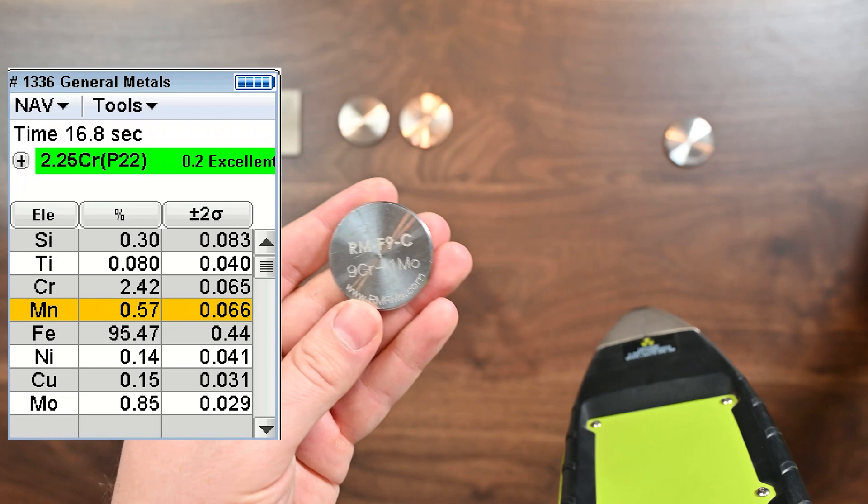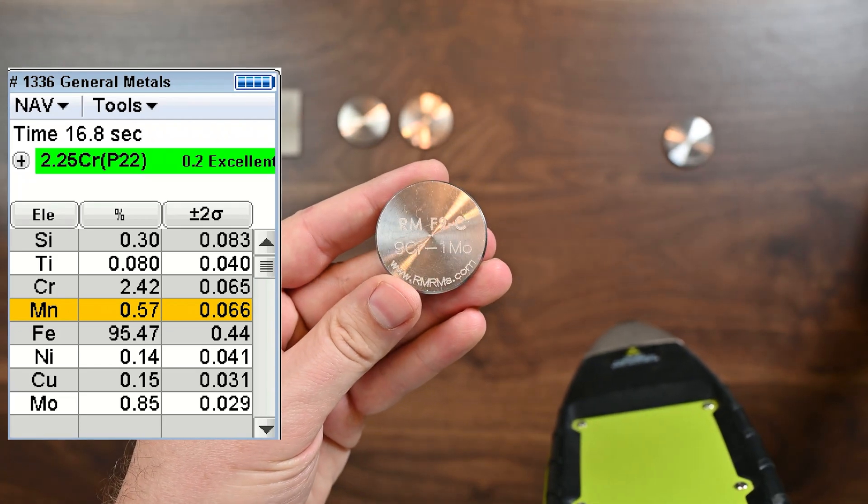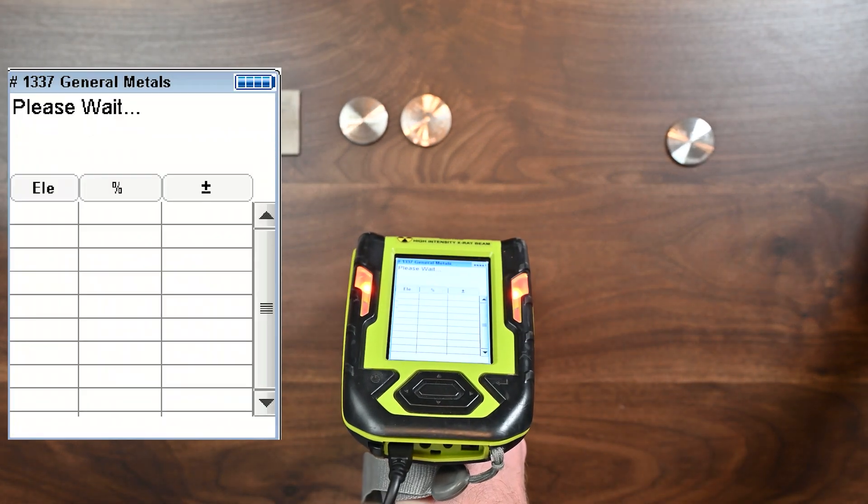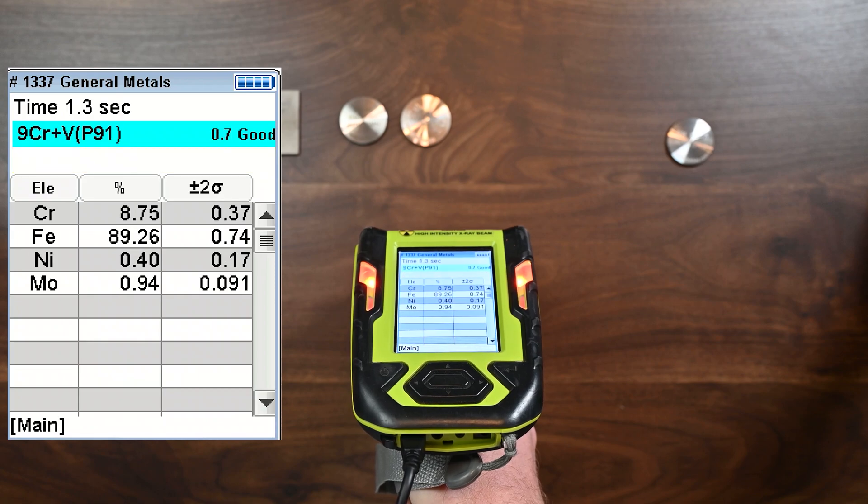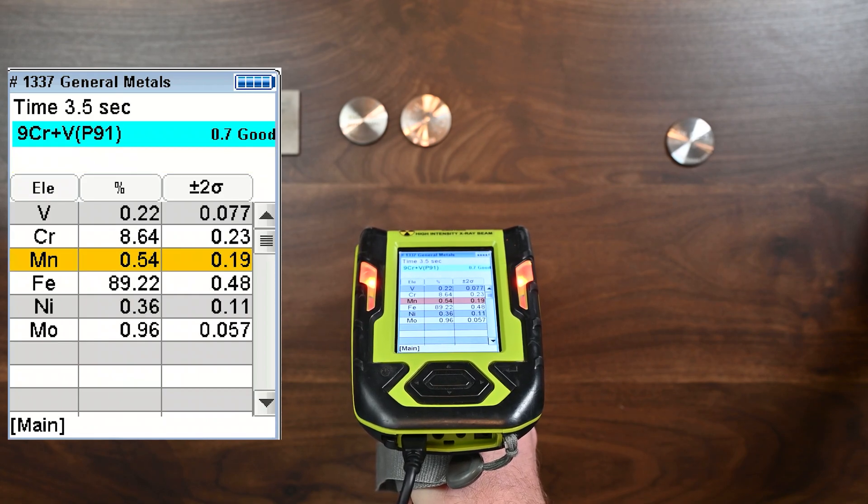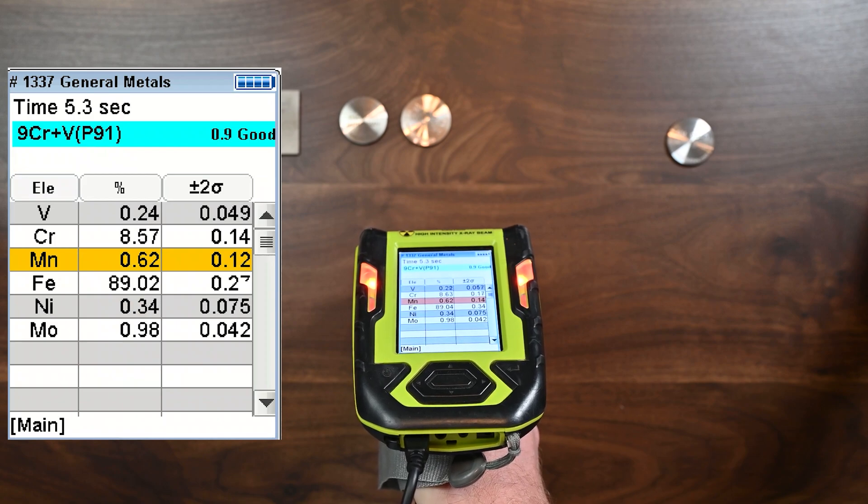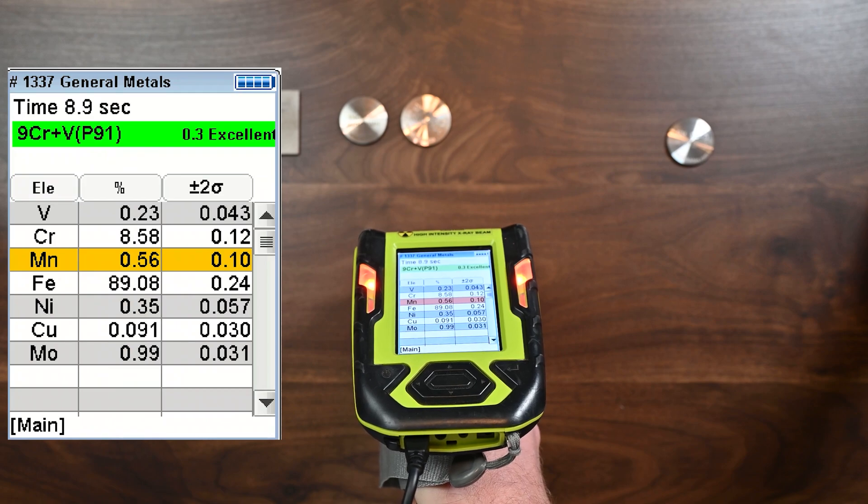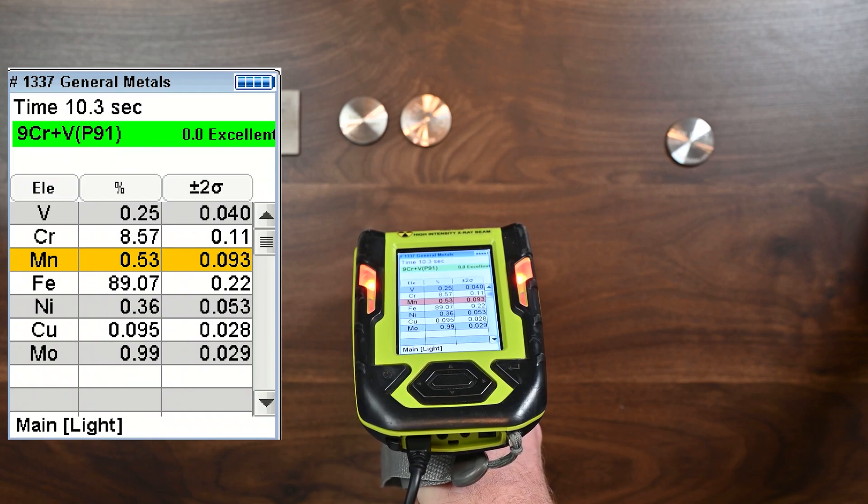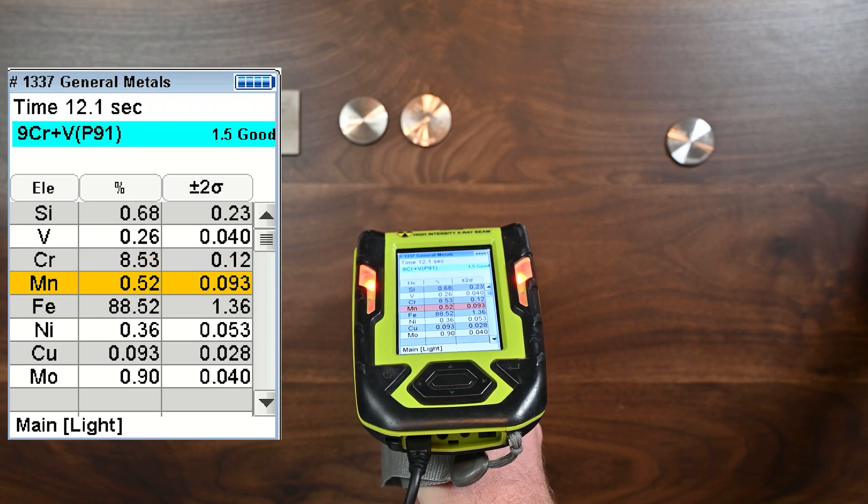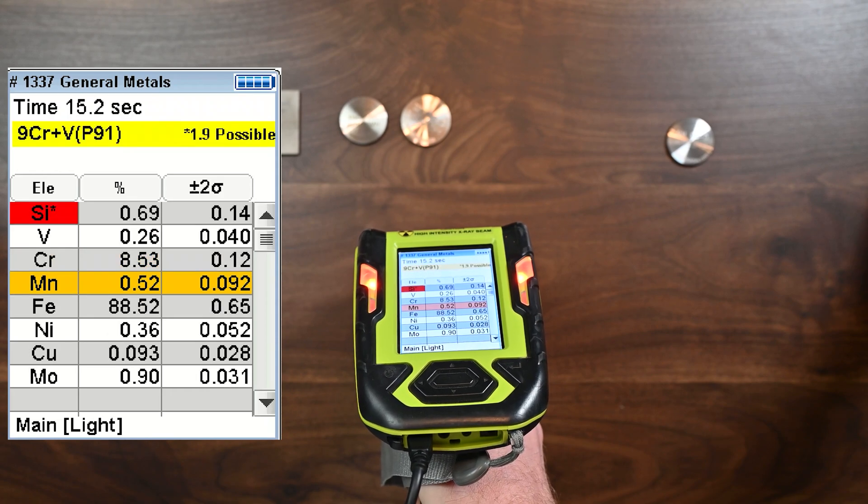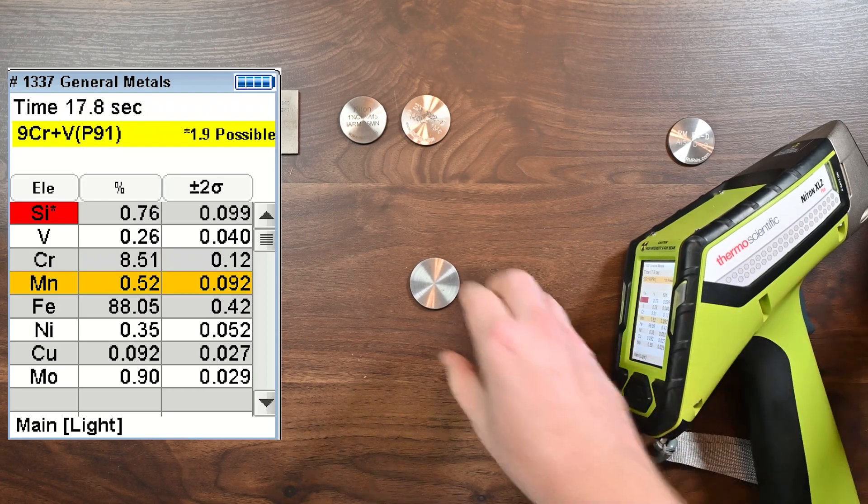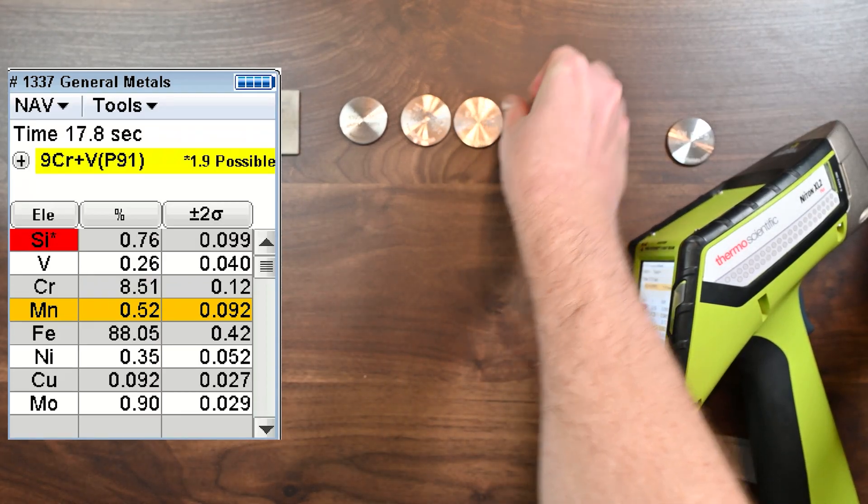So this alloy, this next one is approaching that stainless limit, nine chrome, one molly. Molly is a great alloy to add for corrosion resistance in many applications. But let's just see how we do here. So there's that one second analysis of the grade that it gets right. And then we're going to keep going here. All right. Light element beam is on. Now you see that molly level at one, right? And then that chrome at about 8.53. So I mean, this analyzer is just really breaking everything down for us and it's doing so pretty quickly. So I'm not going to break and look at the certificate for that one today.